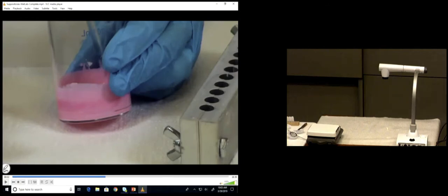What is the first mistake you could possibly make? Start pouring across all 12. So I would take a piece of tape if I were you, you've got tape in there for those parchment papers, and cover up the last 2 holes. Whatever it is, make sure that you're only going to do it into the 10 suppository molds, the cavities.